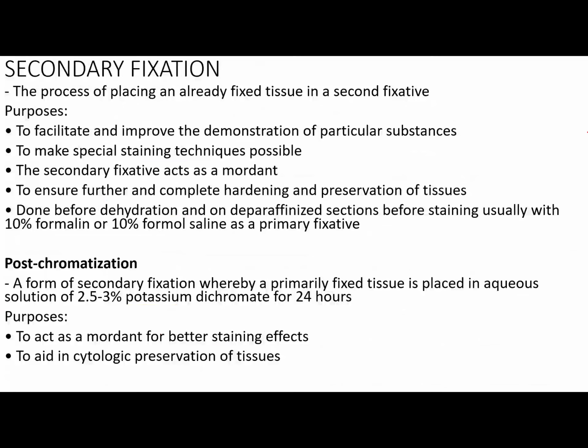Now the purpose or the reason why we do secondary fixation is to further improve particular substances. So secondary fixation is placing an already fixed tissue in a second fixative. So if you have soaked it in formalin, you can soak it again in another type of fixative. That's secondary fixation.